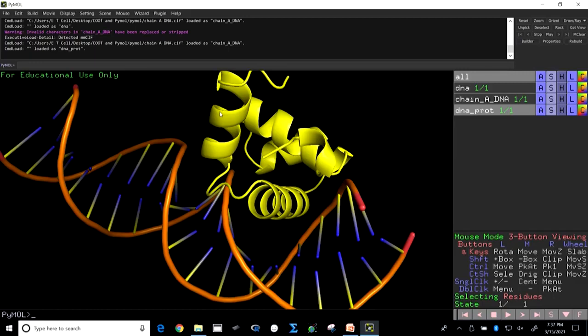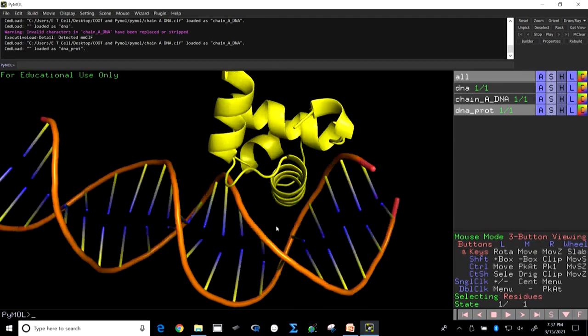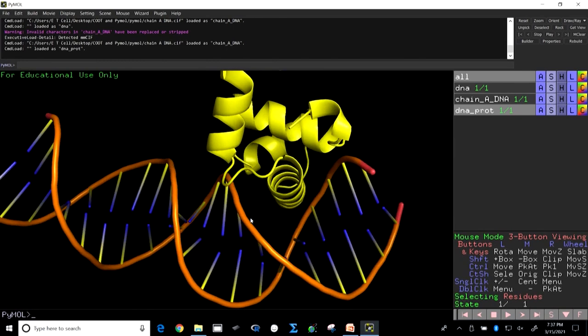You remember when we were going through the protein structure, protein domain, I talked about there are super secondary structural domains which help you to understand the function directly. You do not even know about the protein, but when you see a helix, loop, helix, helix, turn, helix, you know that this protein is involved in protein DNA interaction, which you could see here.